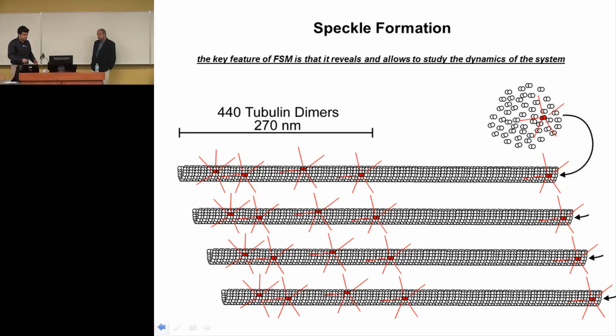So the way this all started is by synthetic simulation of that particle. We can recalculate this system by a stochastic model, and then simulate this stochastic incorporation, because you don't know when a new labeled dimer will be added, or when it's going to fall off.